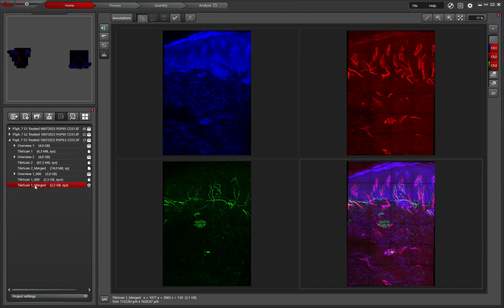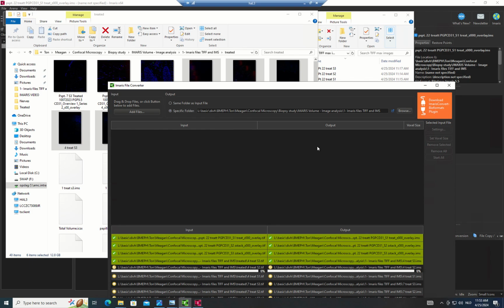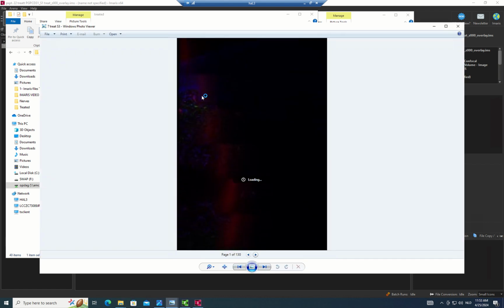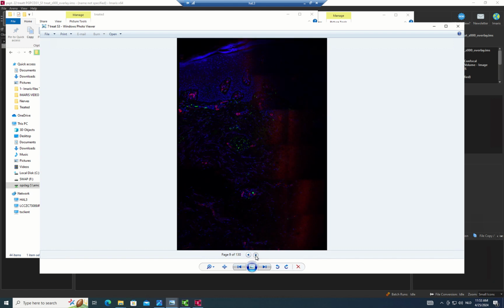And so this will give me a TIFF file that appears, can I show you that? It will appear, yeah, there we are. It will appear as quite a dark file, as you can see here. And this dark file you can click through, and then you'll get each Z-step section, you will see it.